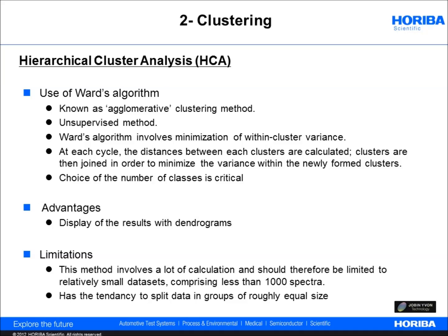Actually, the hierarchical cluster analysis in the MVA module uses Ward's algorithm to set the clusters and pair them. It is known to minimize the within-cluster variance. That is to say, before grouping one object into a cluster, it simulates what would be the impact of the inclusion of that object on the variance of each cluster, and eventually includes that object into the cluster that undergoes the minimal change of its variance after inclusion.